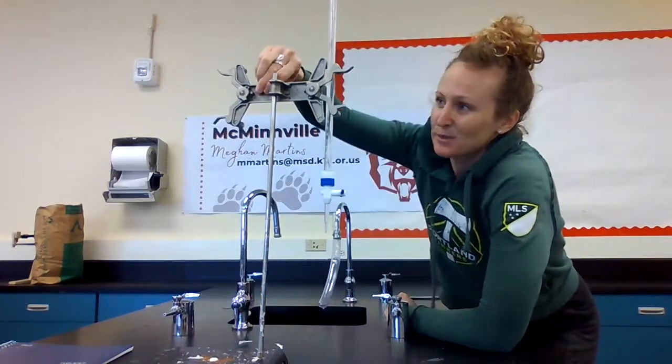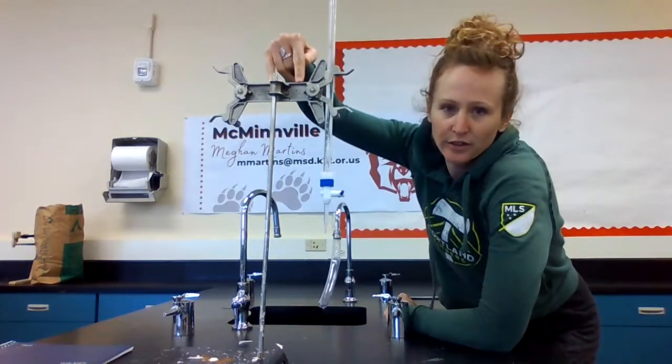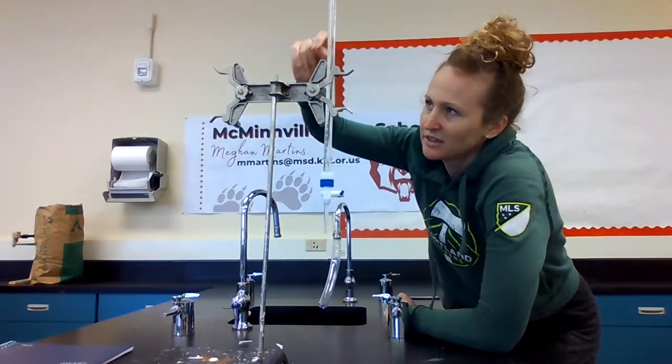All right, we already talked about the burette. Now, the second and third pieces of equipment are already out here. So this pole and the base here, what is it called and what is it for? Hopefully you called it a ring stand. That's what it is. A ring stand is made out of an upright and a base, and it's really good at holding stuff.